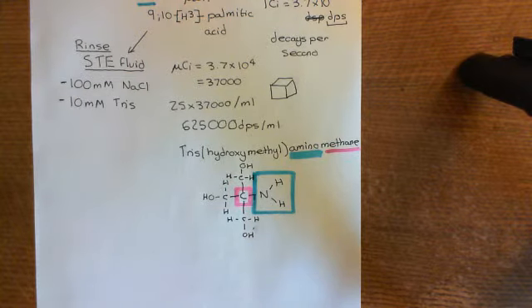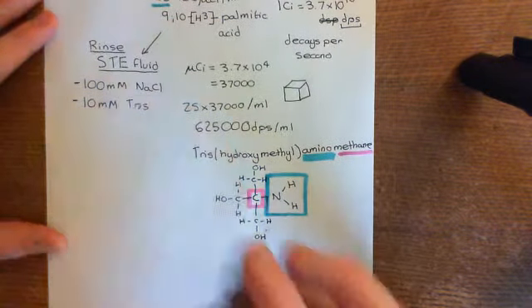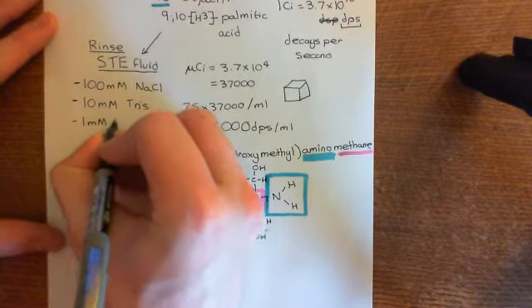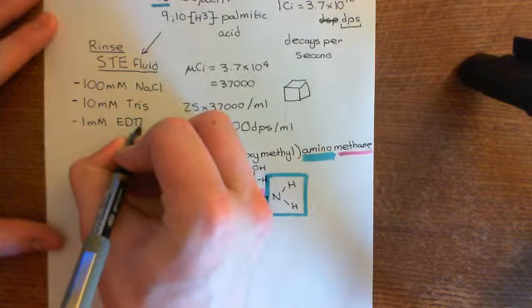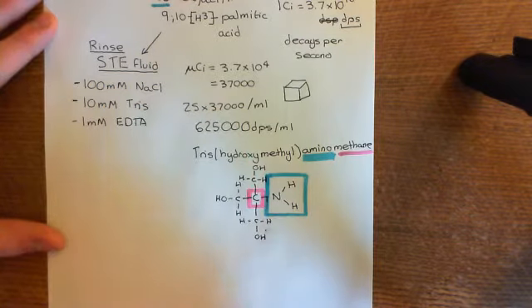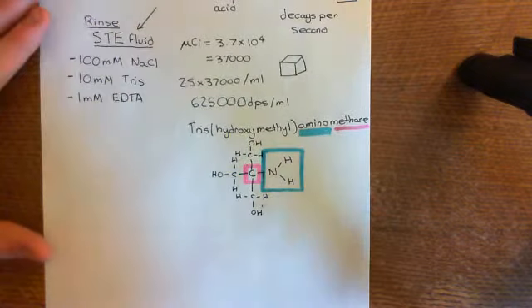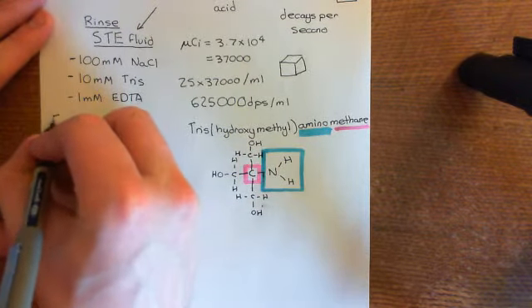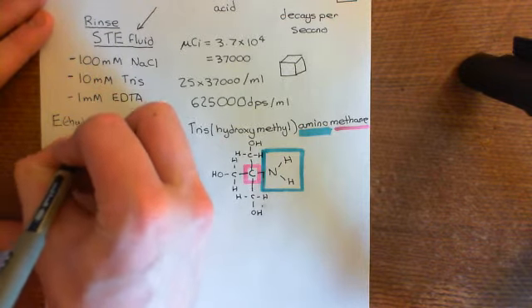Finally, another substance that you have in there, apart from obviously water, is 1 millimolar of a substance known as EDTA. Now, what does EDTA stand for? Well, it stands for ethylene diamine tetraacetic acid. Okay, so I think we better do this here. EDTA is short for ethylene, and it's all one great big word.